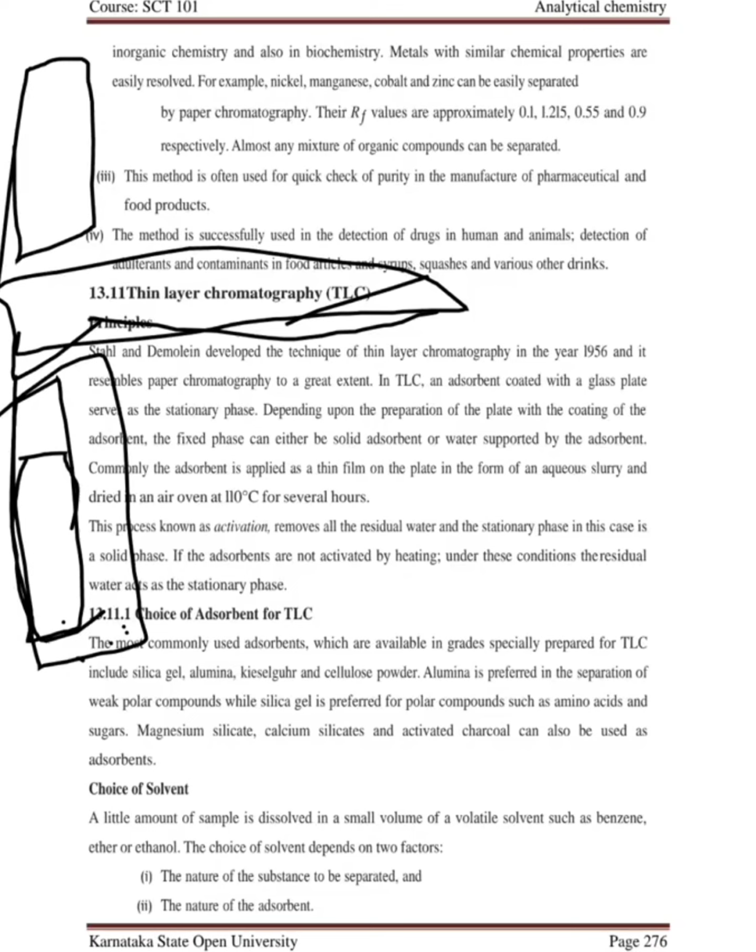So in TLC, an adsorbent-coated glass plate serves as the stationary phase. The adsorbent is applied as a thin film on the glass. The adsorbent is nothing but silica gel or aluminum oxide, and it is dried. These glass plates are dried at 110 degrees Celsius so that the adsorbent is well attached to the glass. Further, we are going to spot the mixture of solutes that needs to be separated.